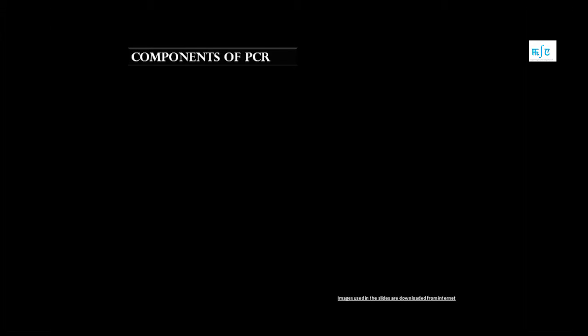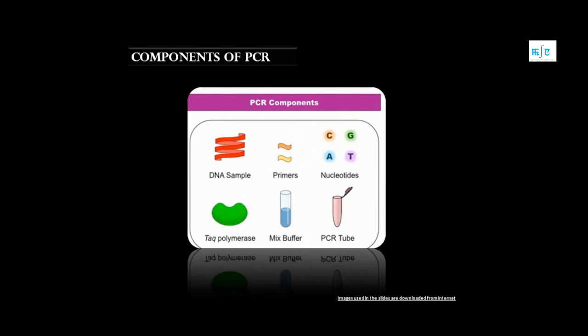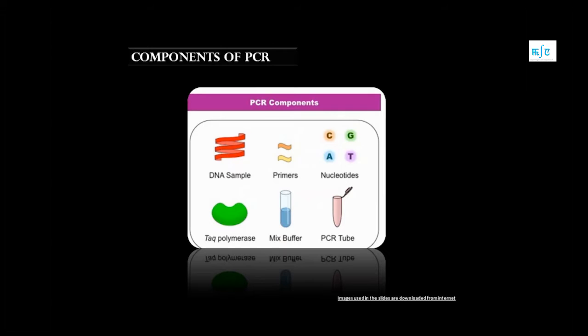So let's see what are the basic components which are required to run a PCR reaction. One of the most important basic requirements is the DNA sample from which the multiple copies of the target region has to be made. And then we require a set of primers. A primer is a stretch of nucleotide sequences which we have to design in our laboratory according to our need. This primer has a specific complementary region to the target region and it will bind the DNA sample and amplify the target regions. And then we require the nucleotides which are the basic letters of the DNA, and then of course the Taq polymerase which is the enzyme.